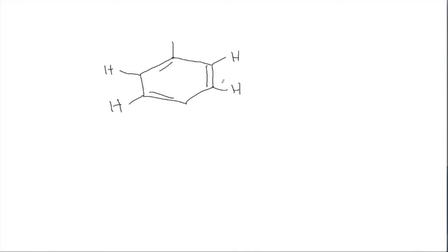Well, first of all, the thing that jumps out at you right at the start is that there's a benzene. We should be guessing there's a benzene because there's so many degrees of unsaturation. And then we have the absorptions in the 6.5 to 8.5 region. So we know there's a benzene, and we know it's got 4 hydrogens on it. And as you said, really the only logical way for those to be arranged is like this, because we want these 2 hydrogens to be equivalent to each other and these 2 hydrogens to be equivalent to each other. Any other way of arranging it, you would get more sets of hydrogens.